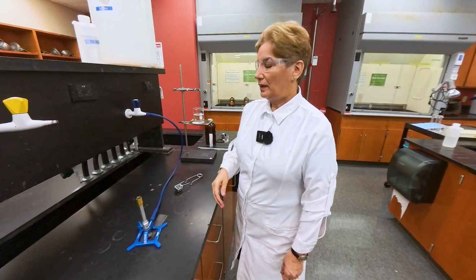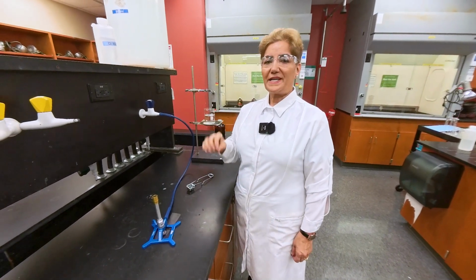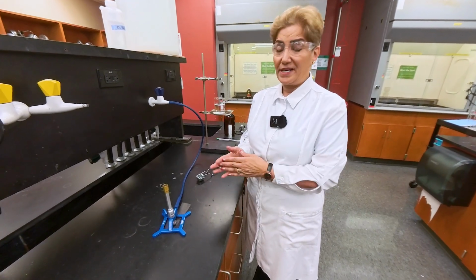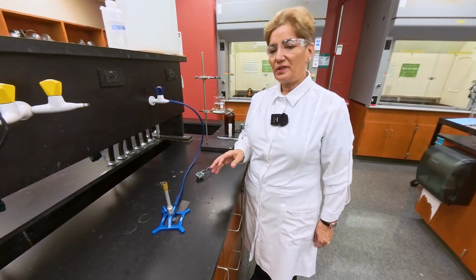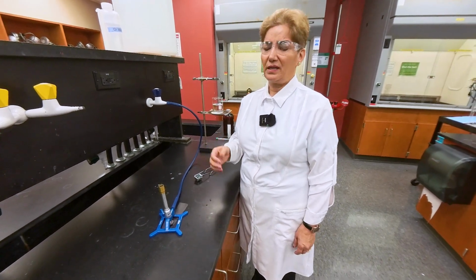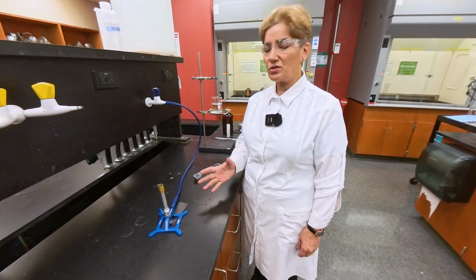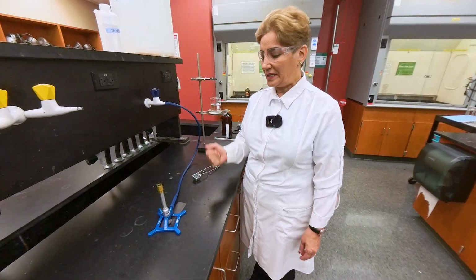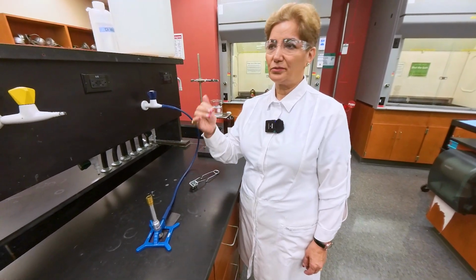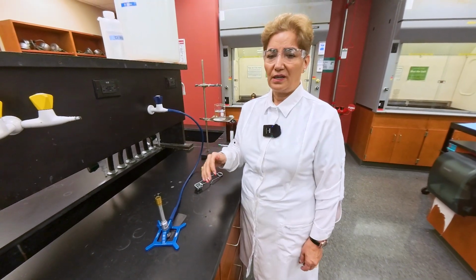Okay. This technique is to turn on a Bunsen burner and adjust the burner. A Bunsen burner is used often in chemistry lab, especially in inorganic and general chemistry lab, as a source of heat. It can provide very high heat, up to about 1500 degrees Celsius.